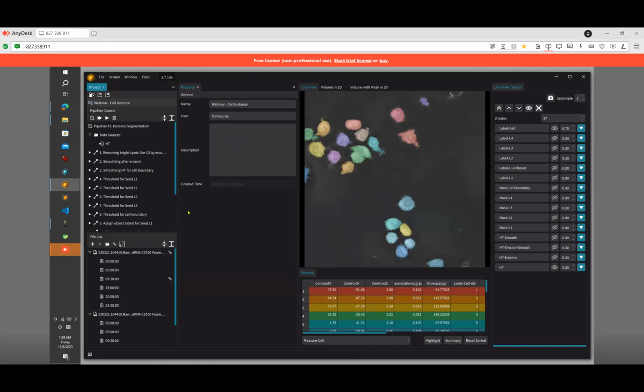So I believe those three pipelines are the basic pipelines that we can use at the moment. And the other pipelines are a combination of these approaches. So when you want to understand the pipelines, just use these three basic pipelines for your understanding, and you can easily understand the other pipelines because they are a combination of two or more of them.